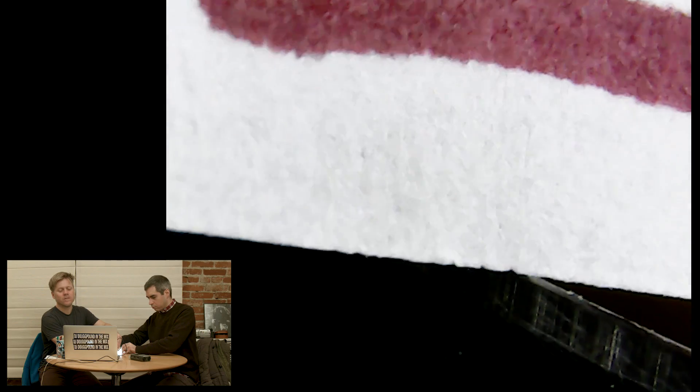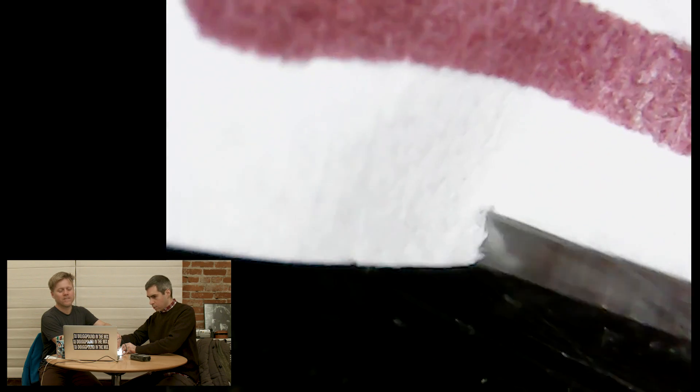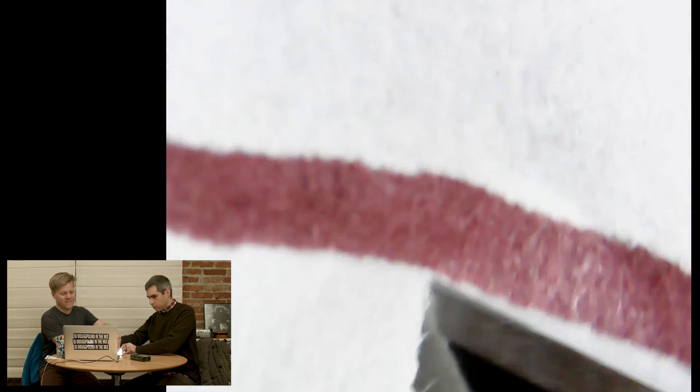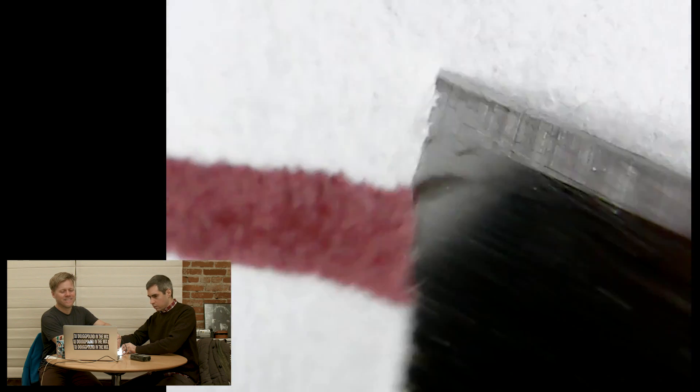Should we see if we can slice through a piece of paper with it? Yes, please. Do it. It's so hard to hold it steady. It's pretty dull. Don't cut my finger now. Look at how it's cutting — it's kind of cool. It's not that clean, actually. Look at that — it's all fibrous. You're seeing the fibers of the paper. It's not super clean. That's a dull blade. I should have brought a brand new sharp blade. Look at the paper ripping.